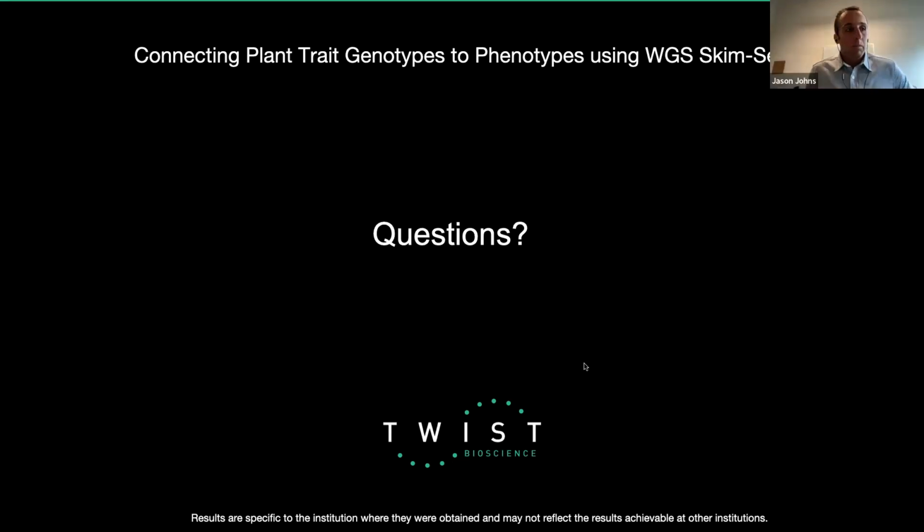Yeah. So bioinformatic tools to filter the low coverage data. There are a million tools out there. And the one that I have the most experience with is GATK, and things like SAMtools, VCFtools, and honestly, I've used a smattering of all of them to accomplish what I need.